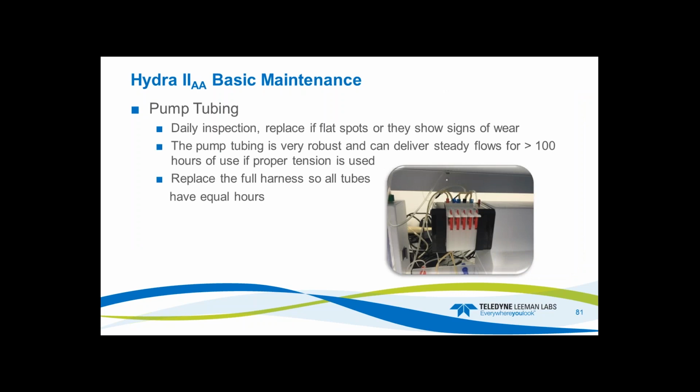It's Santoprene tubing. It's very robust. But if you need to change tubing, I recommend changing all of them at the same time so they all have equal hours. Don't change one and leave the other because then you're just asking for problems.